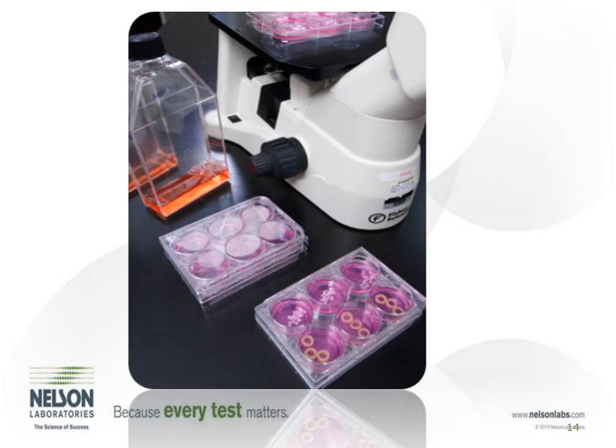So we have a monolayer, or single layer, of cells on the bottom of these plates that we can expose to the test extract. Now, the one unique thing about the cytotoxicity test is that we extract in a specific fluid. That fluid is called minimal essential media, or MEM fluid, and that's where the MEM elution gets its name from. That MEM fluid is just a cell culture media. So it's just a media that provides the cells everything they need to grow and be happy.